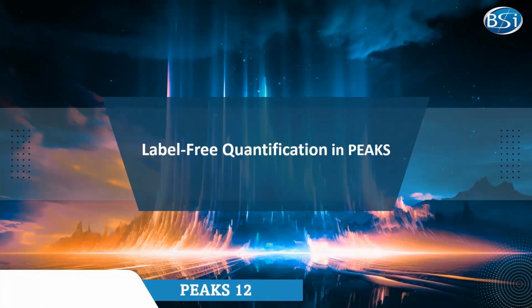Welcome to the PEAKS 12 label-free quantification video tutorial. In this video, I will explain the steps of the LFQ algorithm in PEAKS 12, how to set up the workflow, and how to view the results.